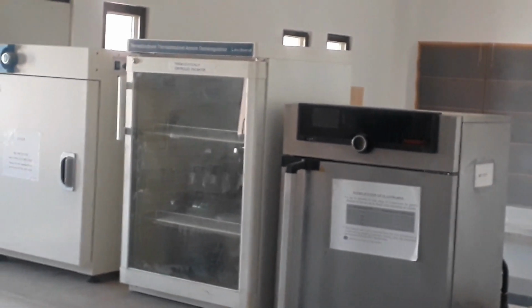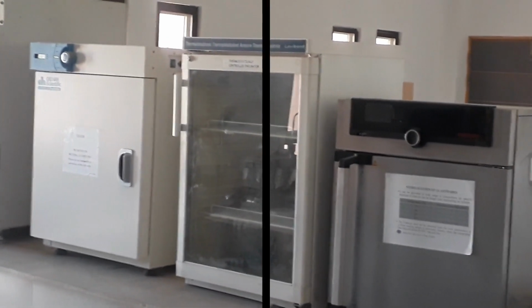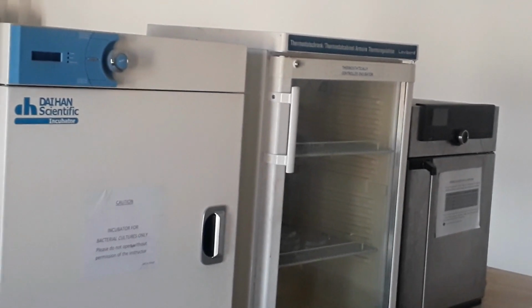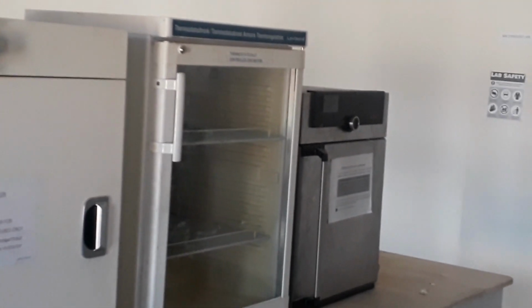They are equipped with features like adjustable shelves, temperature control, and CO2 regulation for specific experimental requirements. Incubators are used for various applications, including bacterial growth, tissue culture, and protein expression.